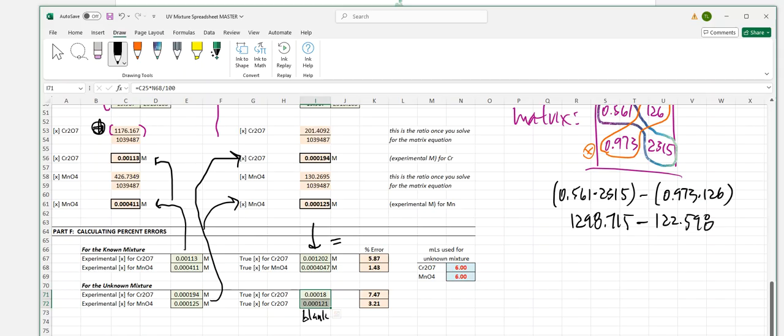I'm going to be okay with that. So leave these blank. And these will also calculate on my side, not on yours. And we hope that those errors are minimized. But you cannot calculate these two sets of data without the volumes that we have used when we made your unknown. And we're going to keep that a secret for you.